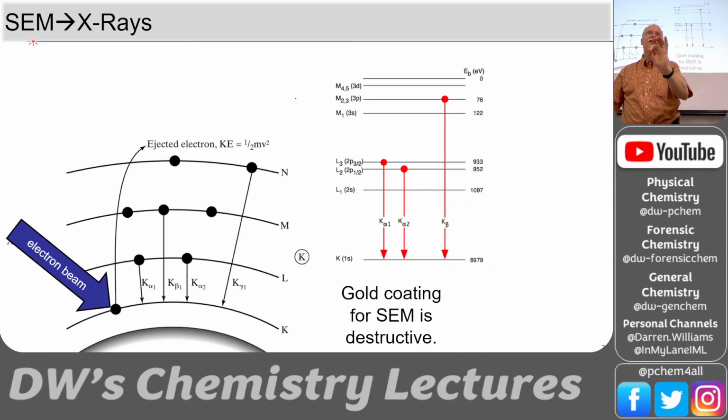So if we have a glass chip from a suspect and from a victim, we can look at that in SEM. Low power, we get an image. We can measure dimensions, and so on. And then we blast it with an electron beam. Pick a square and just shoot electrons at it, and then X-rays will come out of that sample. And we can tell if it's borosilicate glass. We won't learn much about the boron, but the silicon we will get.